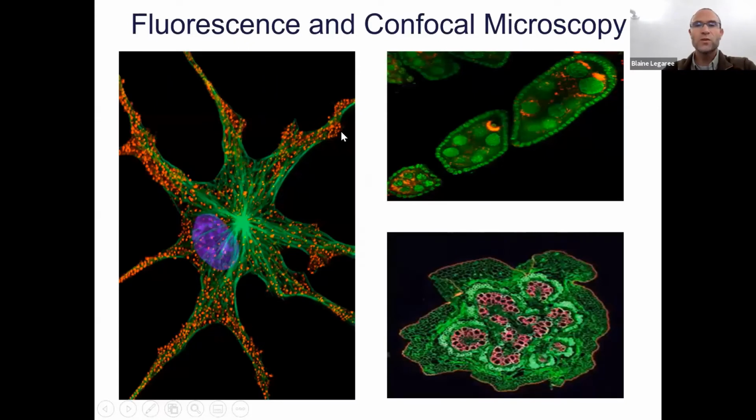There are some pictures. You can see we have different fluorescent stains being used to highlight different cellular features. On the left, those little red things are the mitochondria. You can see the nucleus here, in this big blue ghosty thing, and the cytoskeleton and all these little green things. So some really incredible pictures. I'll show you some more.